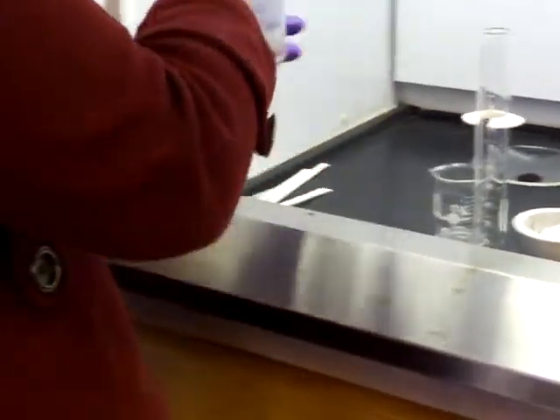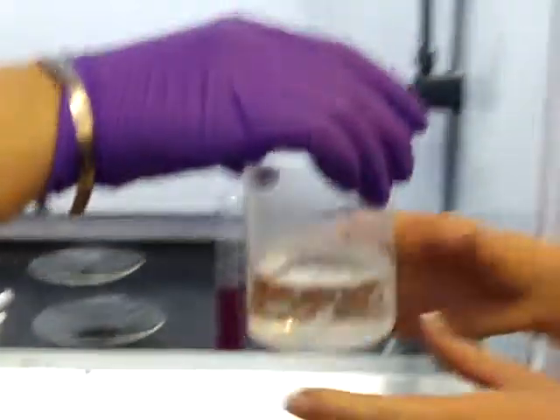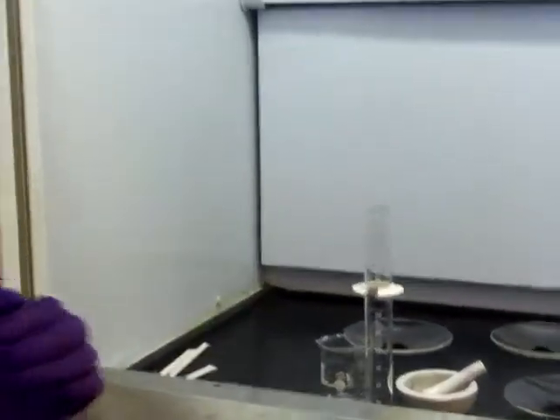Okay, and you guys can pass this one around because this one is not too hot, but it definitely did release a lot of heat. Oh yeah, that's warm. So that's another form of exothermic reaction.